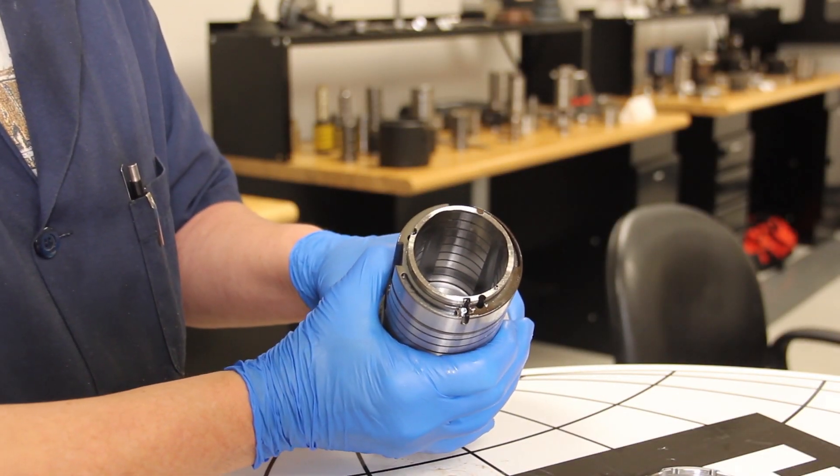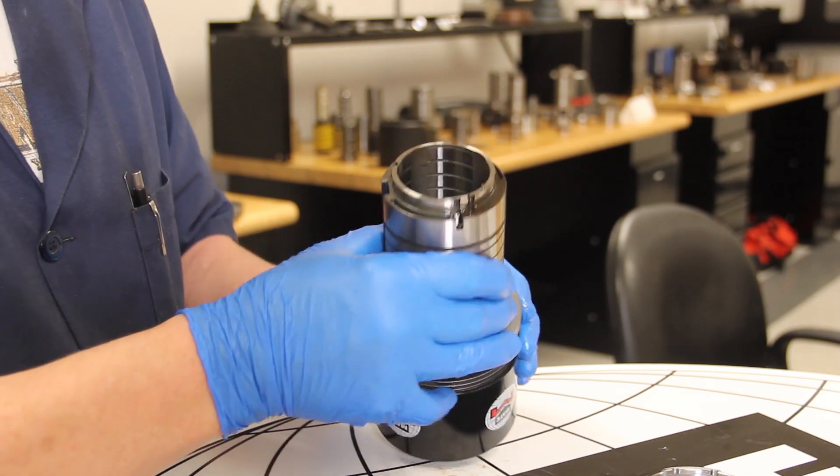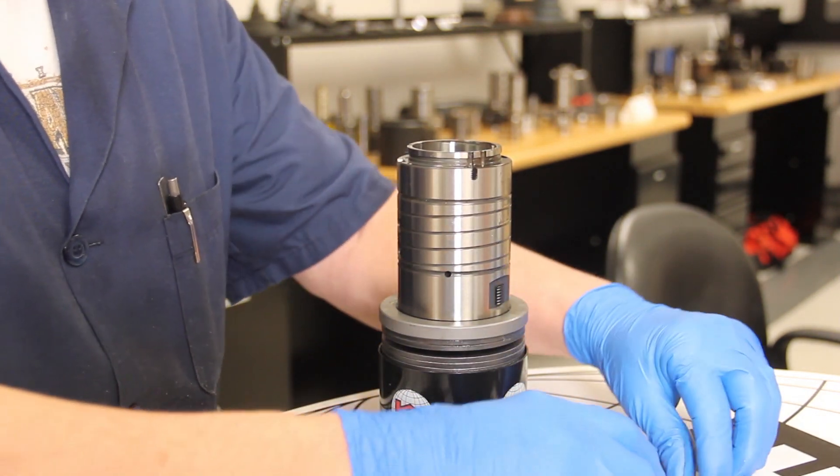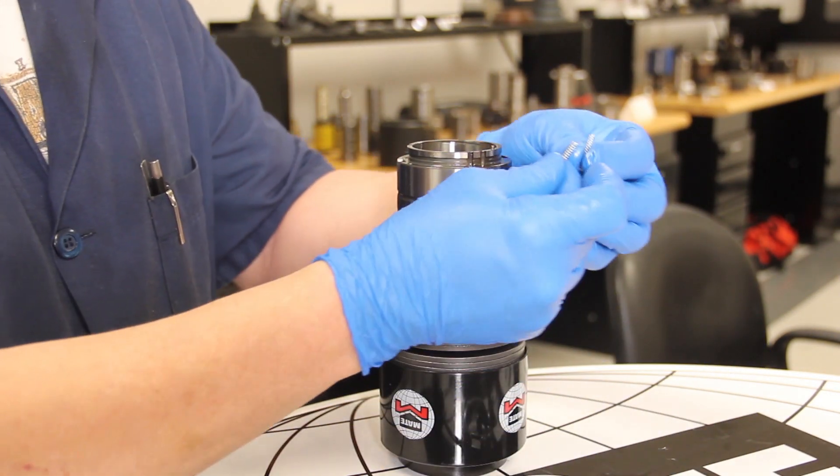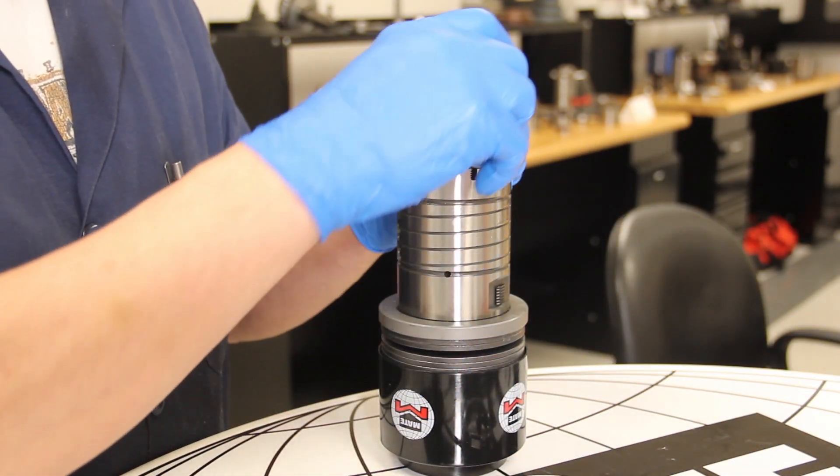To reassemble, we first do an inspection. Then we will install our springs into the ejector pin slots. For this C-Station, there will be three springs to install.